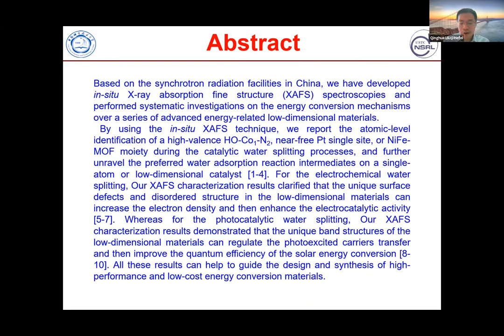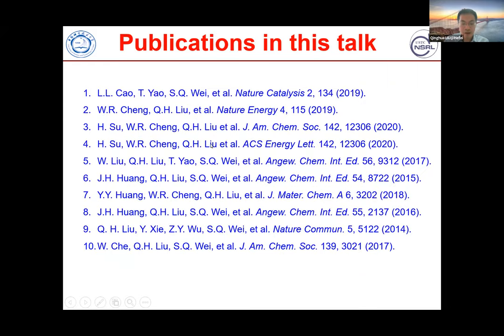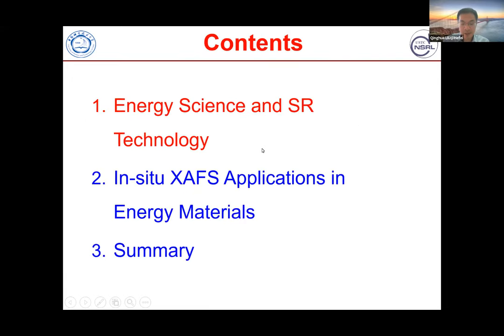In situ or operando X-ray absorption spectroscopy has been extensively developed and widely used in recent years. In this talk, I will present some typical in situ XAFS applications in energy materials. These are the representative 10 publications involved in this talk. Now, let's start the talk. The main contents include three parts. In the first part, I will briefly introduce the background of energy science and the relationship between energy science and synchrotron radiation technologies.